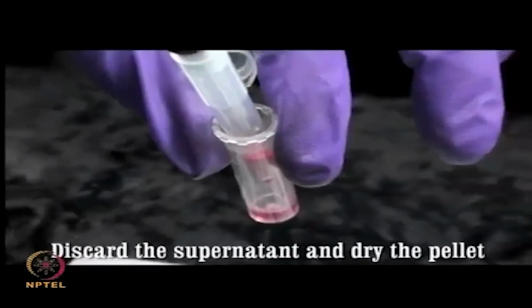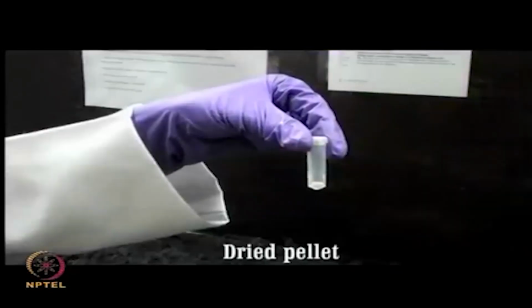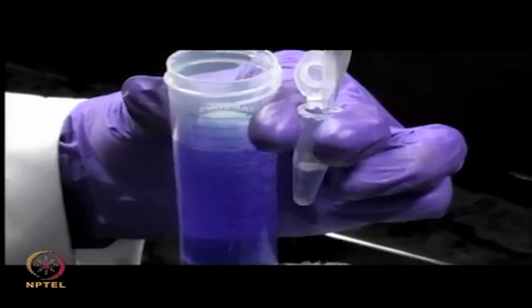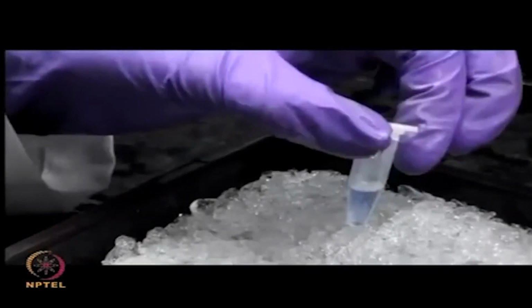Discard the supernatant and dry the pellet at room temperature. Reconstitute the dried pellet with rehydration buffer and store overnight at -20°C before carrying out protein quantification.